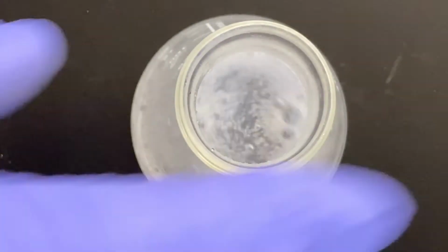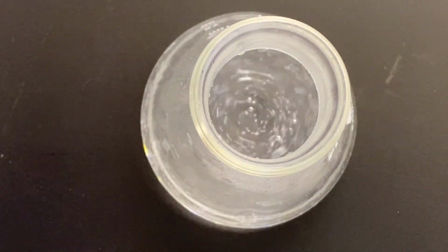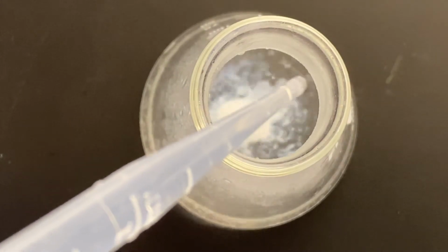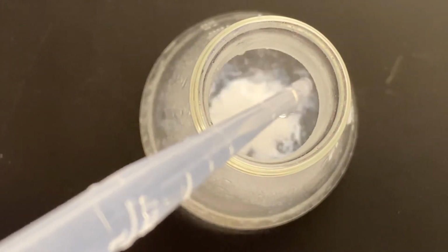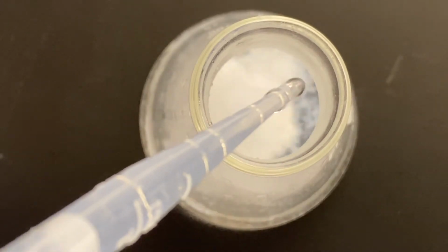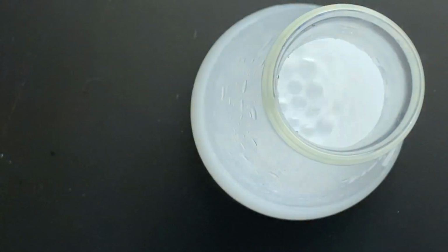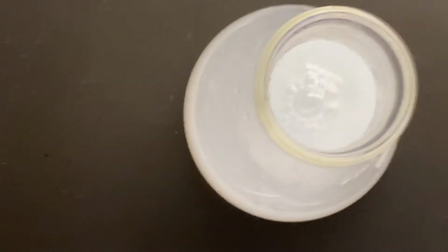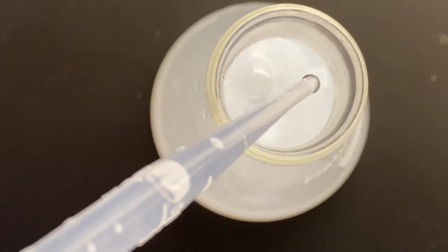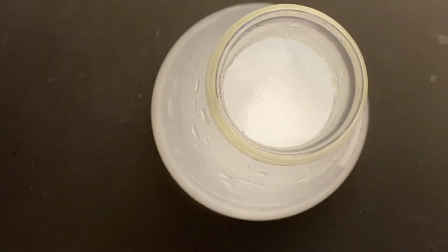And when you get to the precipitation rules, generally sodium ions are pretty much soluble with everything. Oh, hey, redissolved. So again, it redissolved because we have a more equal distribution of the acid in our solution. If we swirl it and it stays a precipitate, we know we've added enough sodium carbonate, which it appears we've pretty much done. But we'll add a little bit extra just to make sure.